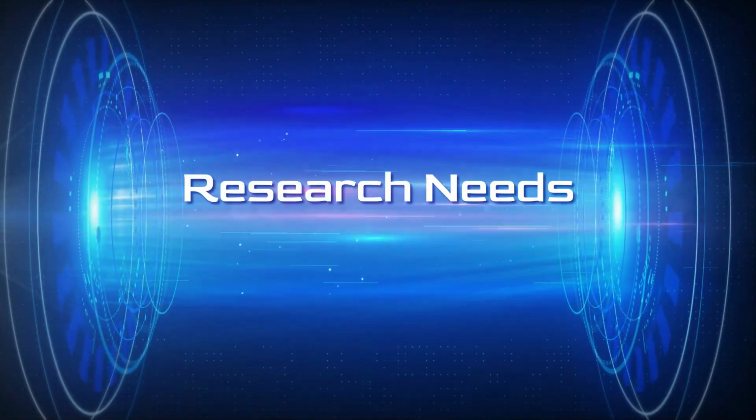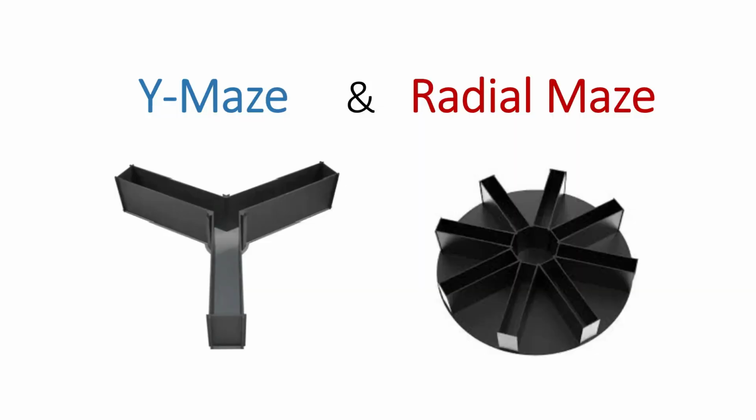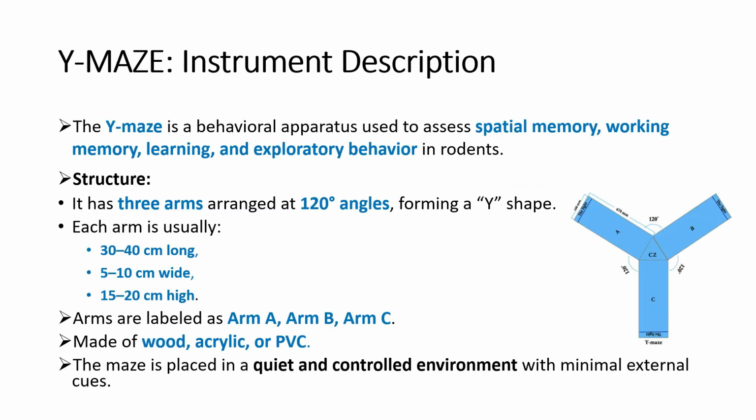In this video we will see Y maze and radial maze, a small protocol for both, and we will see about the terminology used in Y maze and radial maze and their explanation. So we will go ahead and see. So what is Y maze?